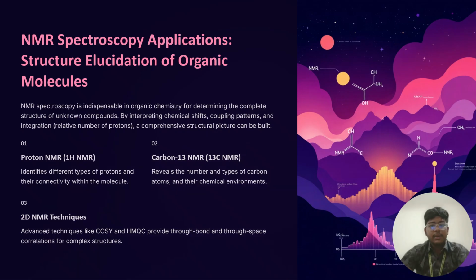NMR spectroscopy is applied to structure elucidation of organic molecules. NMR spectroscopy is indispensable in organic chemistry for determining the complete structure of unknown compounds. By interpreting chemical shifts, coupling patterns, and integration, the relative number of protons, a comprehensive structural picture can be built.